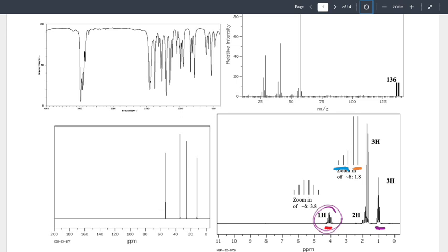For your own practice, what you could also do would be to look at that signal down there and ask, do I agree and see 6 peaks? Theoretically, you should hit 6 peaks. You should be able to look at the actual digital image and say, yep, that's 6 peaks. I do think that's hard, which is why I provided a zoom in. Does that make sense?